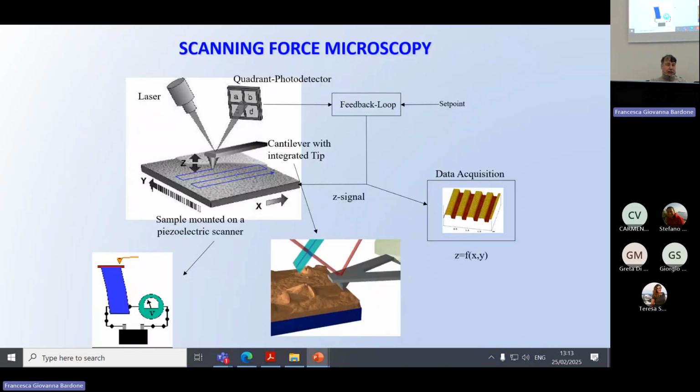The image is recorded and acquired with the scanning method. So the microscope takes the name scanning because you get an image using the scanning principle. But look how it works. Imagine a very, very small pyramid or cone facing downwards towards the surface of your specimen.